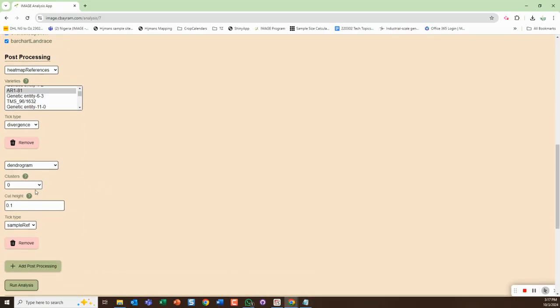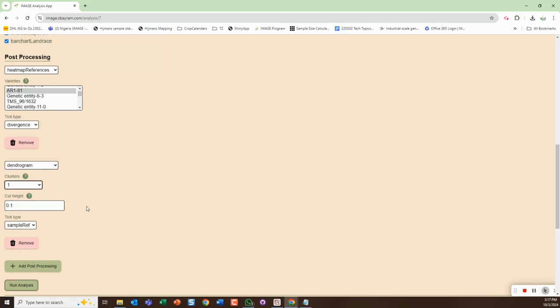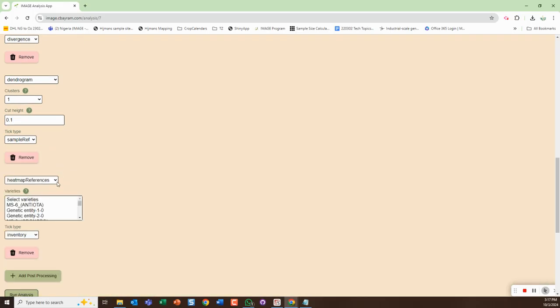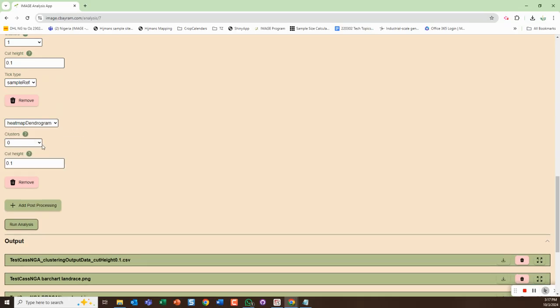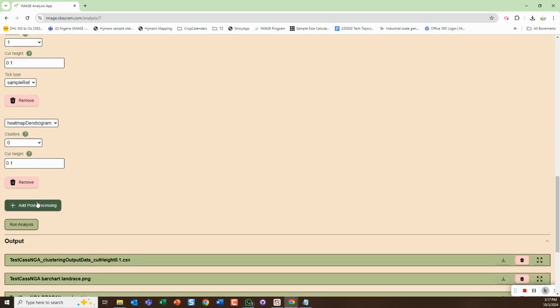Then I can add another post processing if I want. Instead of a heat map I could do a dendogram, and I could do that for clusters however many there are - so we could do it for cluster one. Then if I wanted to do another post processing, I could also do the heat map plus the dendogram. We'll just do that for cluster zero.